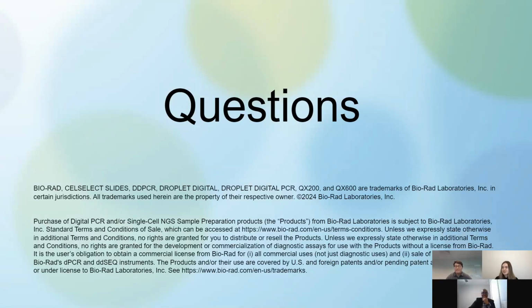Thank you. Now, Dr. Bodunrin, can you comment on why ddPCR was used for this workflow application versus qPCR? Thank you so much for that question. As we've said in the previous slides, ddPCR has obvious key technical advantages, one of which is absolute quantification in copies per microliter. Another advantage over qPCR is that we do not use a standard curve for ddPCR analysis. And because we read at endpoints, there is less worry about PCR efficiency. And ddPCR can be more tolerant to PCR inhibitors, which is not the case for qPCR.